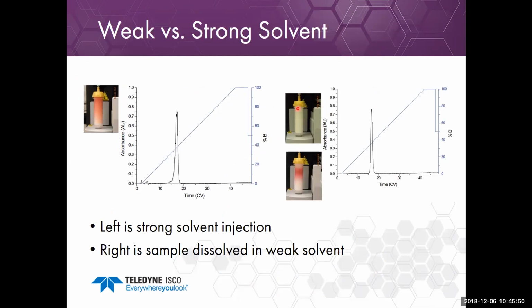Okay. Another question that we've had come in. Could you comment on reuse of flash columns? I've had good results suctioning off remaining solvent prior to reuse. I'm going to assume that the question refers to C18 reverse phase flash columns and other bonded phase flash columns. And those are designed to be reused many times. Although I don't suction off the solvent, I just wash them in methanol, and then I just put the end caps back on and I store them in methanol.